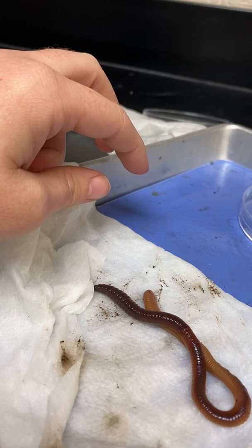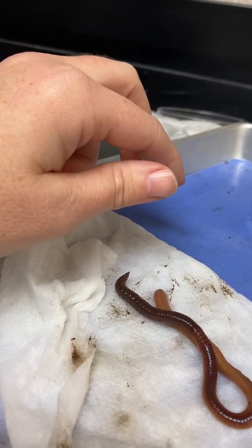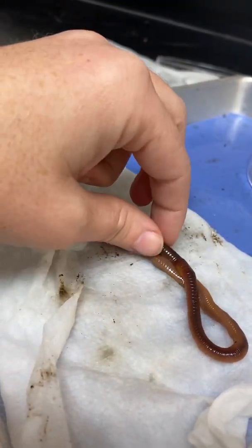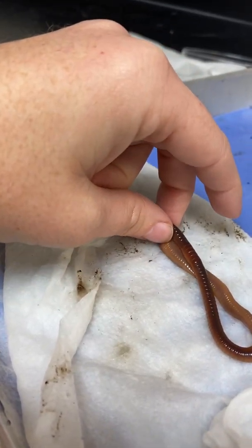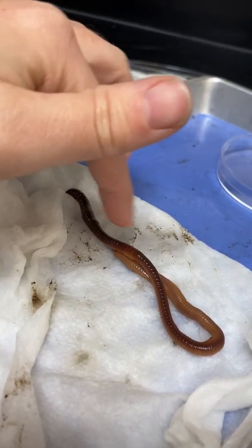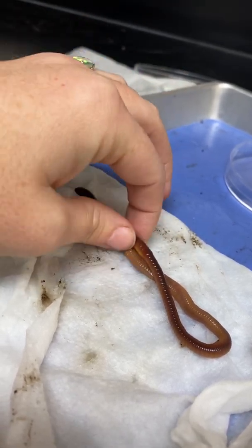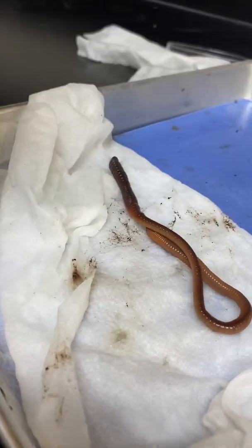Then number 7 says the earthworm looks shiny, waxy on its outer surface. What structure provides this waxy covering? That waxy outer protective covering is called the cuticle. We learned that in the notes. It says, based on number 6, why must the earthworm stay moist, and how does the structure in number 7 aid in this? They must stay moist in order to do diffusion of gases, respiration through their skin. The cuticle helps keep in the moisture, helps protect it, and keeps the earthworm moist.